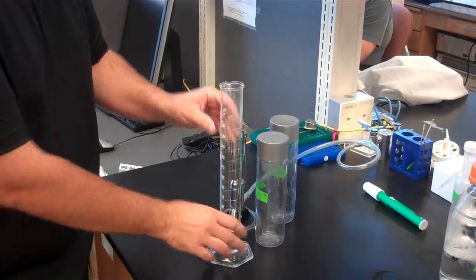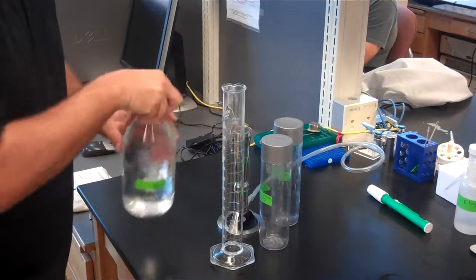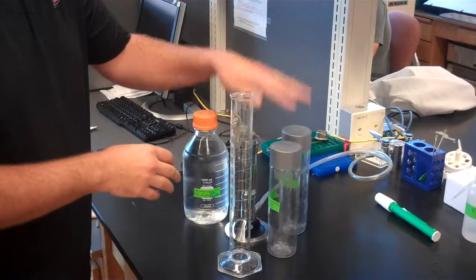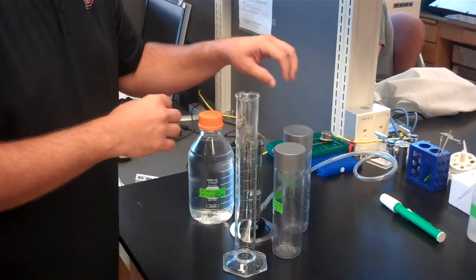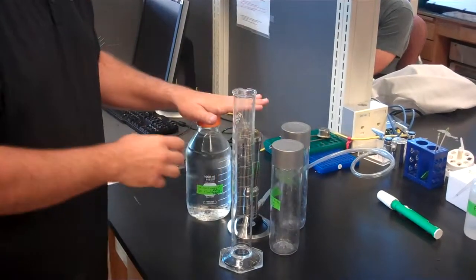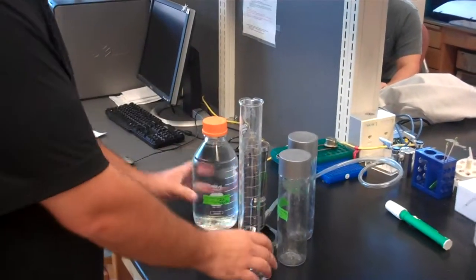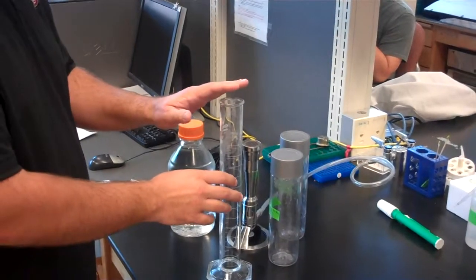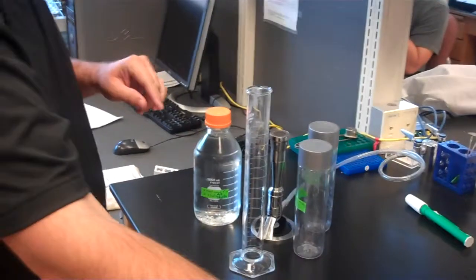So I'm putting the graduated cylinder so I can see the numbers right in front of me. We've got the media that we're going to pour into this and then put into the water bottles. These have all been through the UV light in the goggle sterilizing cabinet. So these are sterile. This has been sterilized and the weighing media has been sterilized when it was made. Okay. So now that I've got everything set up, the first thing I'm going to do is be pouring this into the graduated cylinder. So I have it kind of set up in this range here.